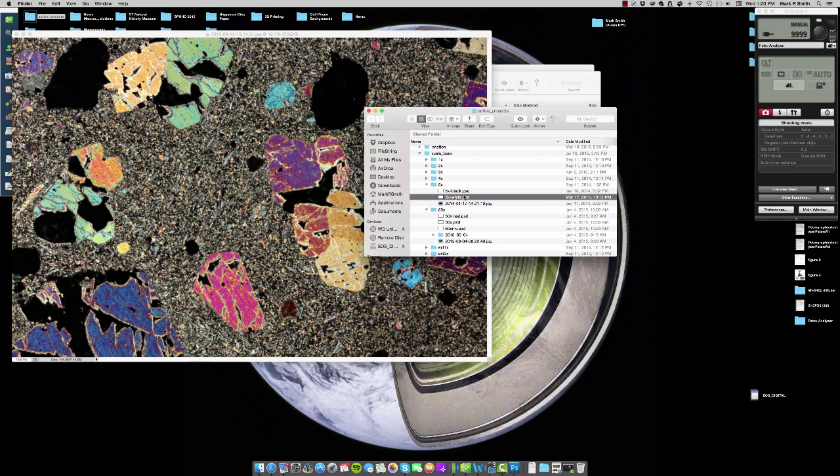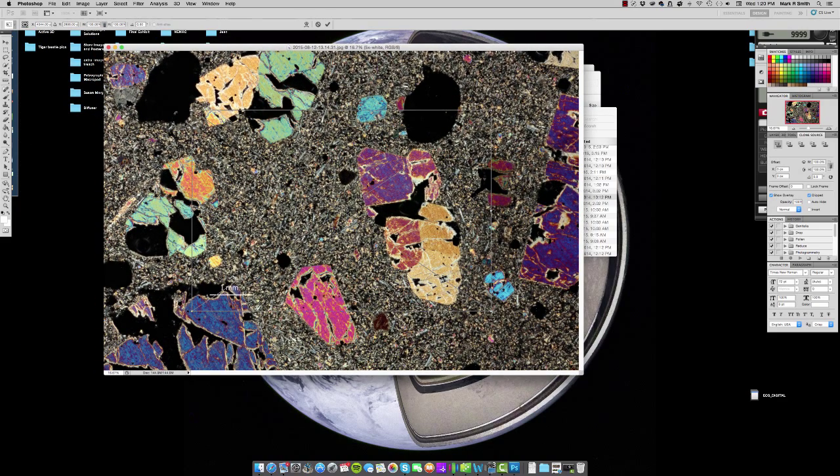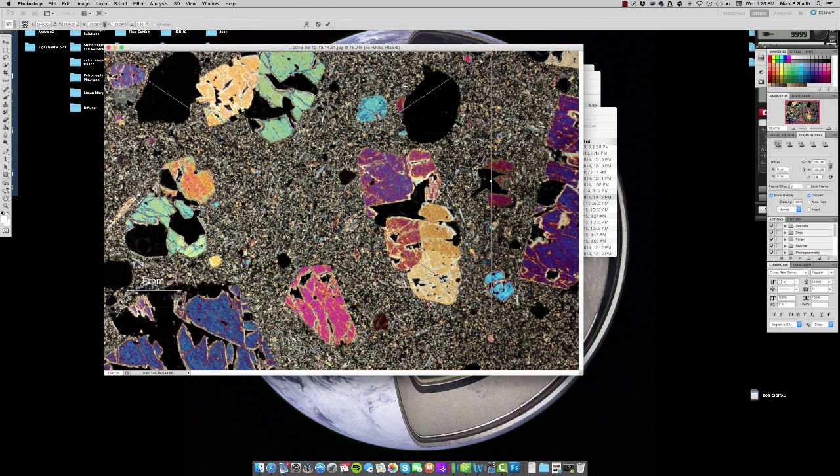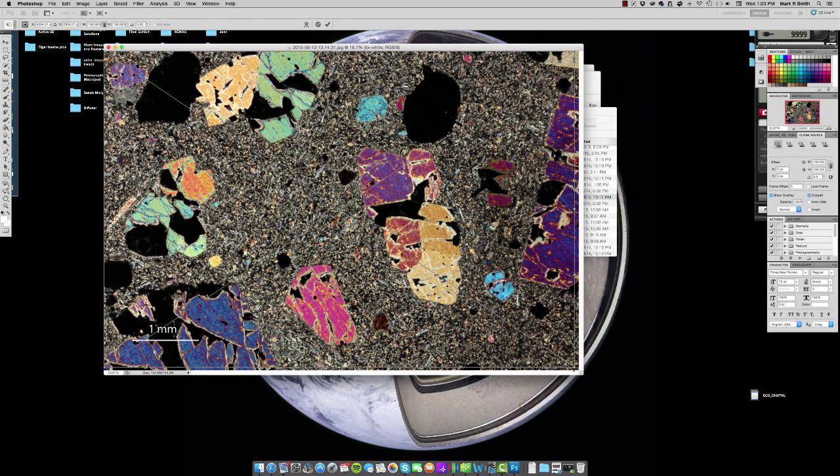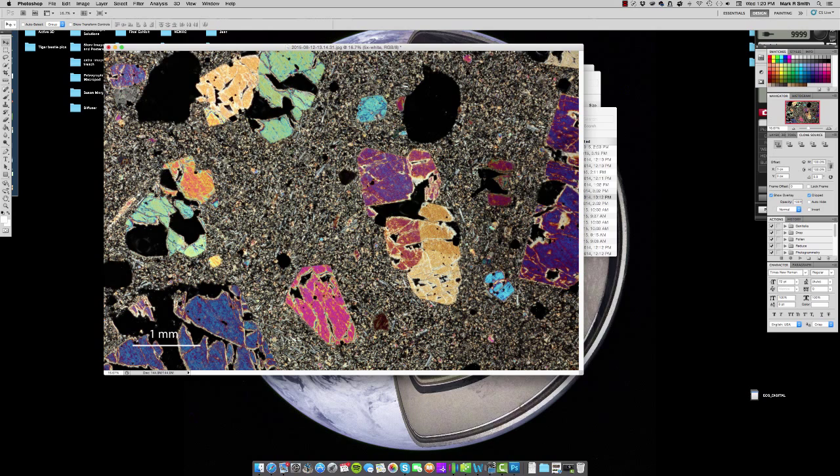I want a white scale bar because the contrast is going to be a little bit better. Because I used a larger camera sensor, this is 51 megapixels as opposed to the 21 that we normally use. This is actually a good demonstration to show you the difference in sensor size. That initial square was the 21 megapixel zone. This is now at 51. So that scale bar is exactly one millimeter across the slide.